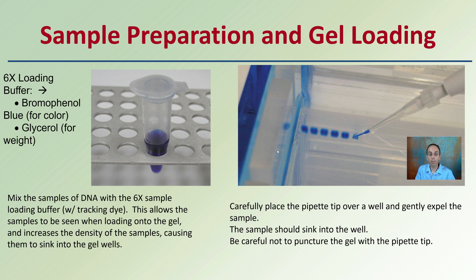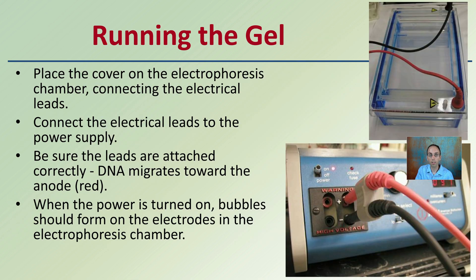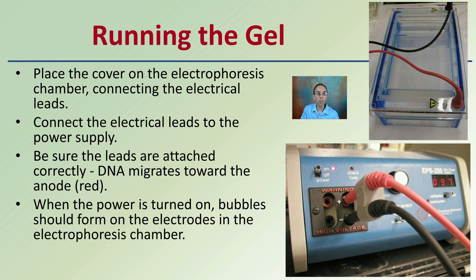With good pipetting skills, carefully place the pipette tip over the well and gently expel the sample — it should sink into the well. Be careful not to puncture the gel with the pipette tip; this requires a very steady hand. To run the gel, place the cover over the electrophoresis chamber, collect and connect the electrical leads to the power supply. Make sure the leads are attached correctly — positive and negative in the right areas — because DNA will migrate toward the red anode, the positive end. When power is turned on, bubbles should form in the electrodes, indicating a flow of electrical current.